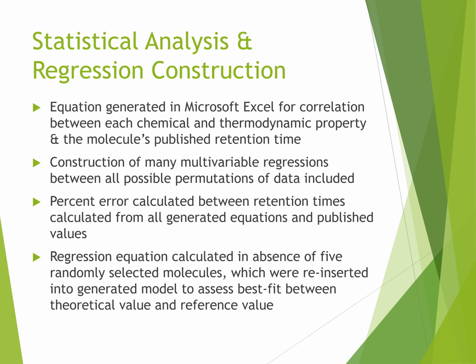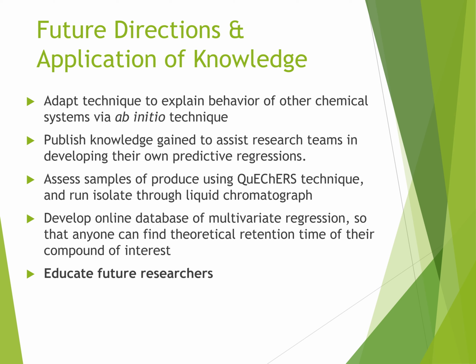The percent error will be calculated between retention times calculated from all generated equations and published values. The smallest percent error regressions will show the tightest fits. All of the regression equations will be calculated in the absence of 5 randomly selected molecules, which will be reinserted into the generated model to assess the best fit between the theoretical value and the reference value for each generated multivariate regression. The future directions for this research are to apply the knowledge gained.